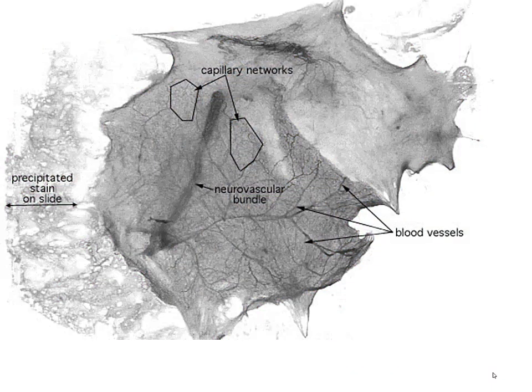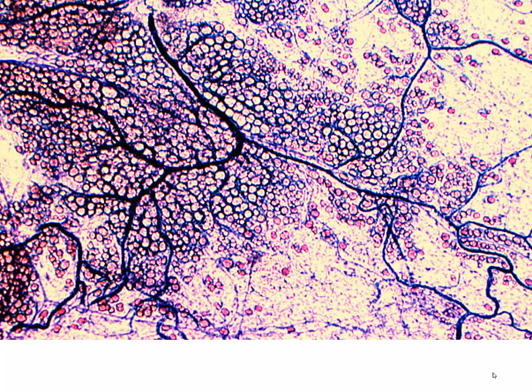I'm not exactly sure where this comes from, but as we look at this and zoom in more closely to the tissues, we're going to see blood vessels in the tissue. We see some nerves, capillary networks. But as we look at higher and higher magnification, we're going to see more and more detail and be able to visualize more and more of the cells and the molecular components that we see within connective tissue.